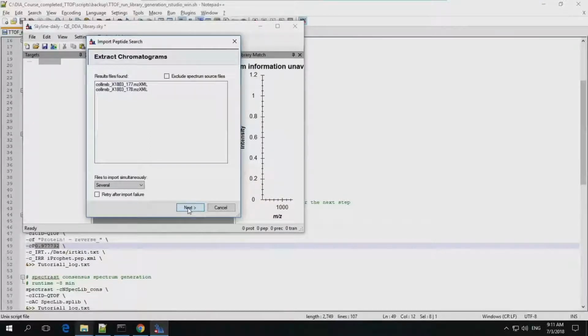You want to tell people, okay, this is for C18 chromatography. You're going to give them a file that is your IRT library, and there's no space in that library to have five different methods. You can have one method per library. But as long as they have the same type of chromatography, you can merge IRT libraries in Skyline.